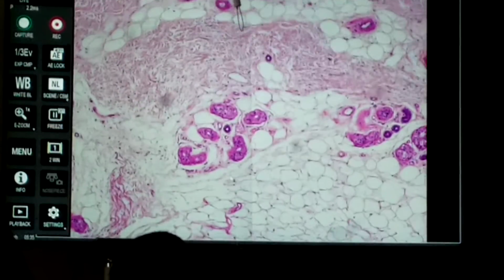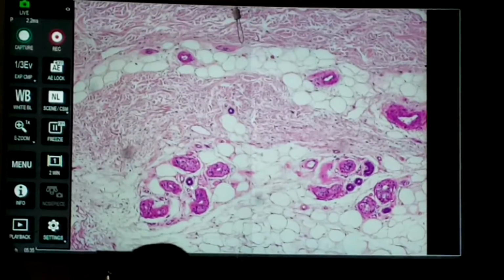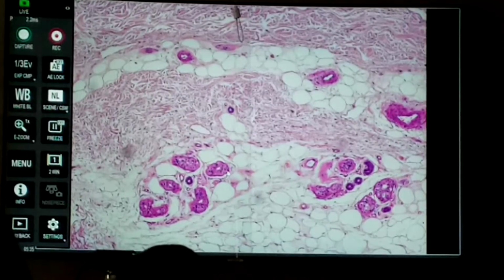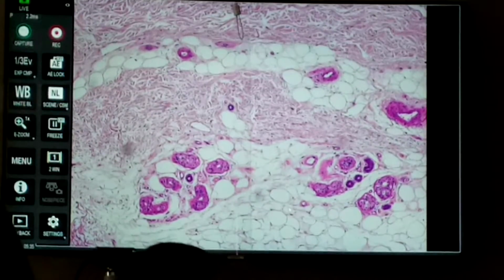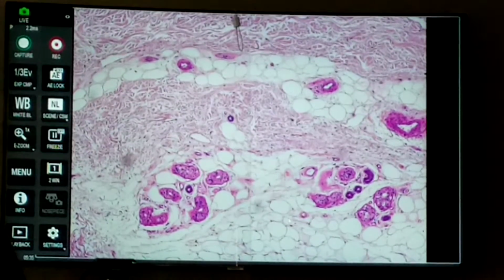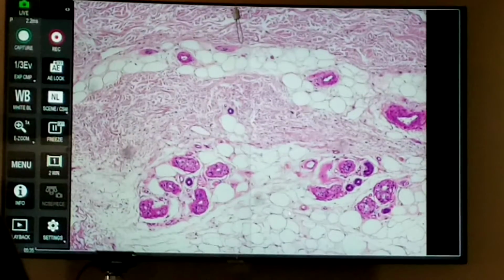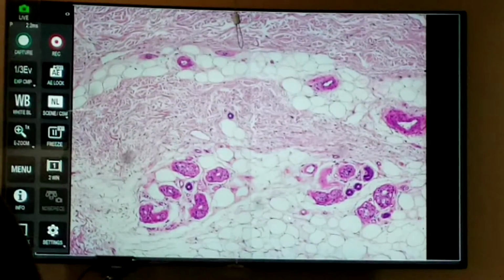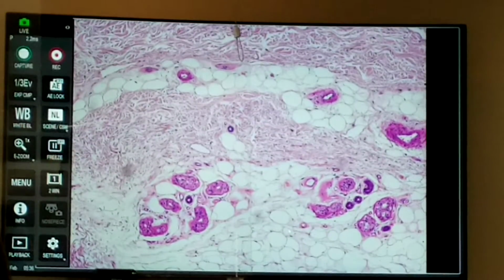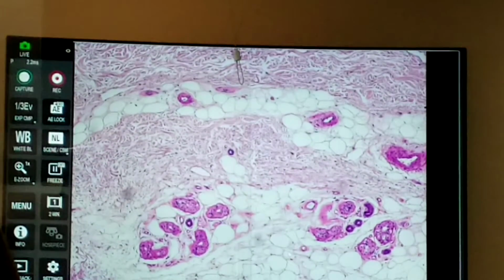The sweat glands, when you reach the secretory portion, okay, you see multiple units here. And these are actually all part of the same secretory unit. Because what happens with a sweat gland is this. These are simple coiled tubular glands. So from the surface, a duct comes down and gives rise to this coiled secretory unit.